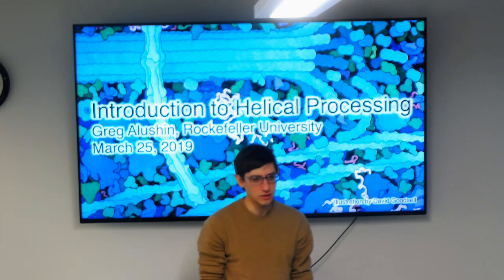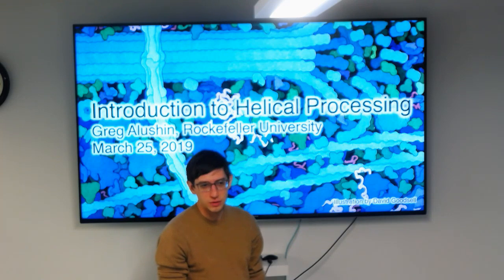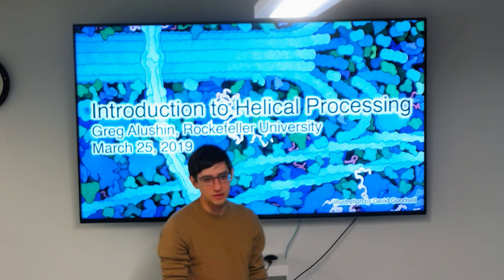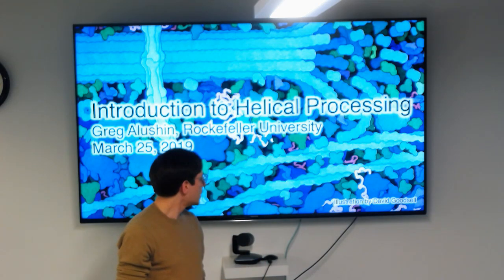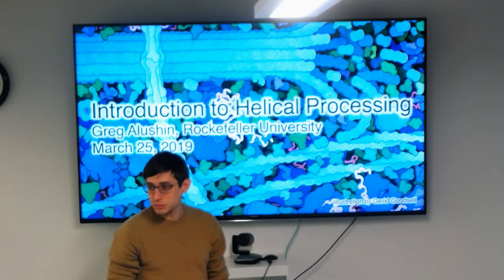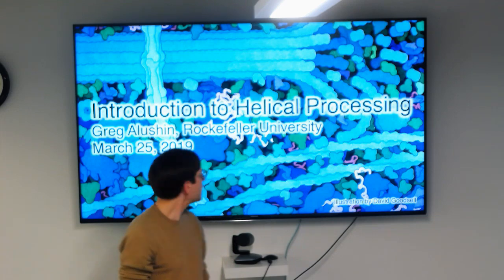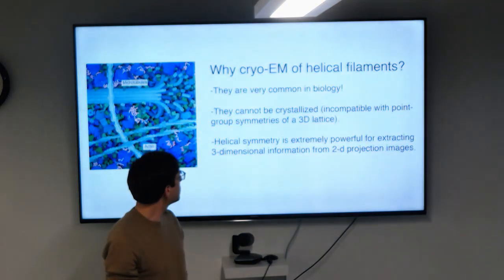I think helical processing is sometimes a bit counterintuitive. So if you have questions, you're like, this doesn't make any sense at all, please just stop me and let me know. I've tried to keep this lecture fairly light and not deeply mathematical, because Fernando Sosa is actually coming to give a follow-up talk next week that will delve more into the dark art of indexing helical diffraction patterns. So I wanted to today mostly give a sort of overview.